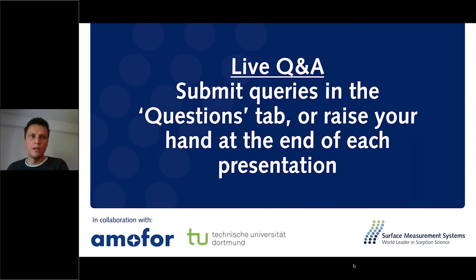Yeah, definitely. I didn't have the time in this talk now to discuss that. You saw that in the sorption profile, just roughly. I made the sorption prediction for the fully amorphous state, for the phase separated state, and for the crystallized state. It is covered in the model and it is considered. Phase separation might accelerate crystallization, due to that you might have a different shelf life than just from the normal crystallization mechanism, but it's considered.